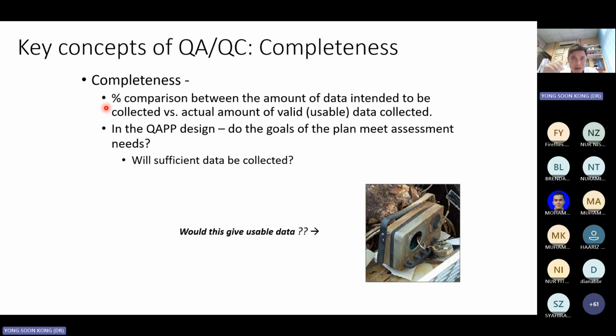Like I said, now is a planning stage. Pandai-pandai lah you all plan how many samples that you want to collect. And even if you're affected by these uncontrolled factors, you still have enough number of samples that you can make a robust conclusion.